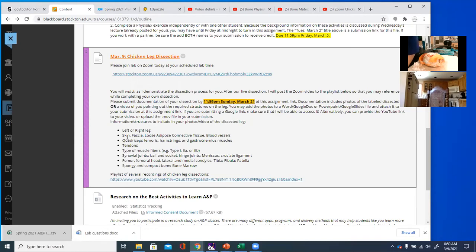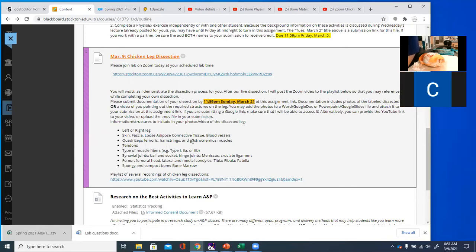I want you to show me the skin and fascia — the connective tissue deep to the skin that attaches it to the underlying muscle. I also want you to show me fat as well as blood vessels. These three muscles I just talked about on the model: the quads in front, the hamstrings in the back of the thigh, and the gastrocnemius, the big, pretty calf muscle.